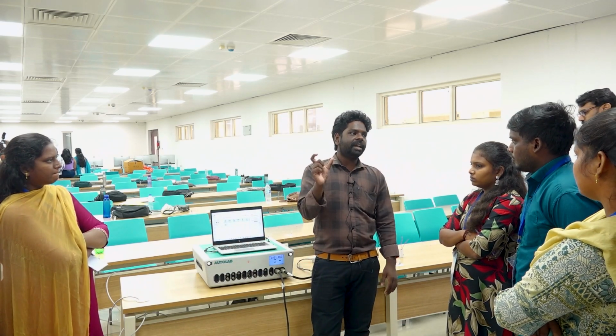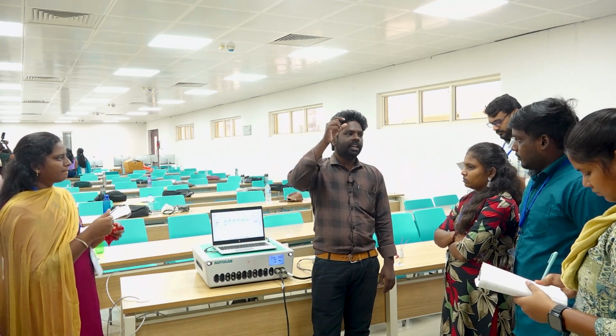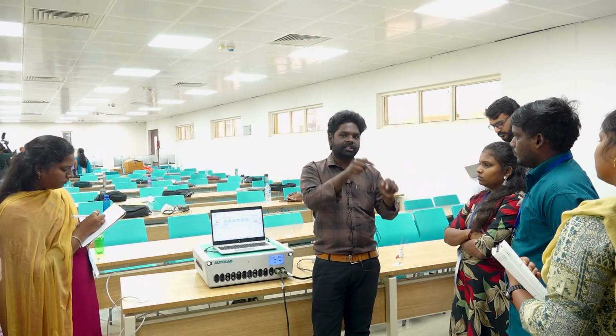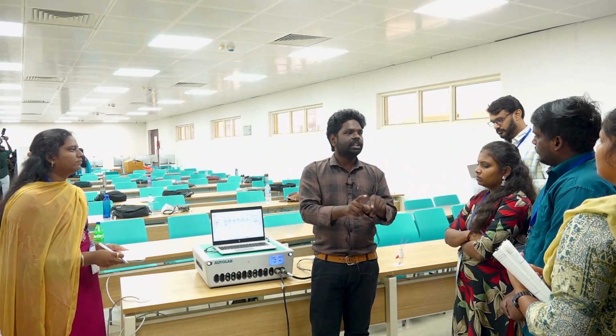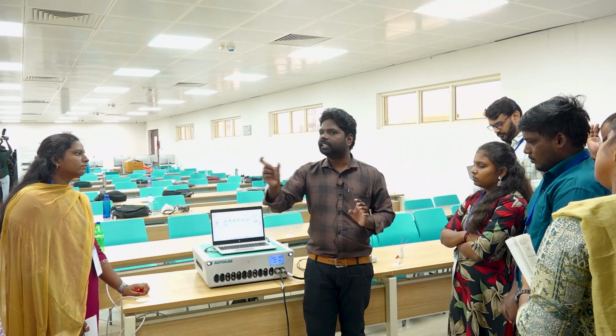So this diffusion property we can observe using the EIS, and that is called Warburg impedance. If you take any sample, electrolyte will be there, and the electrolyte is responsible for conduction. Based on the diffusion, the conductivity rate is decided, right? So we can analyze these diffusion properties through the EIS.